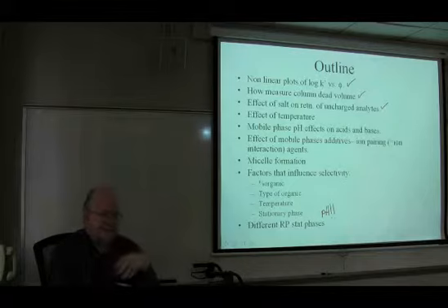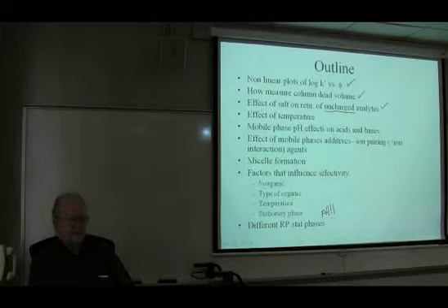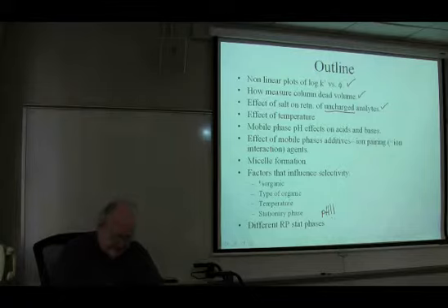When we add salt to the mobile phase, what happens to retention? In particular, we're going to talk about neutral or uncharged analytes. The effect of salt on an uncharged analyte is not big, unless it's a really big molecule, and then maybe there'll be a big effect. The effect of salt on anions and cations is another story. So we're just going to talk about the effect on neutral solutes today.